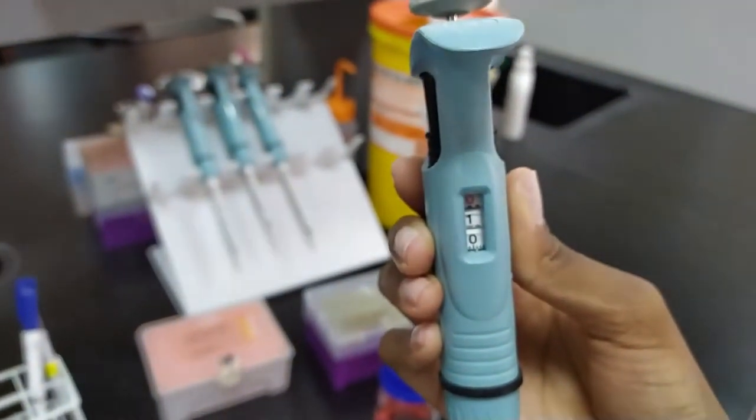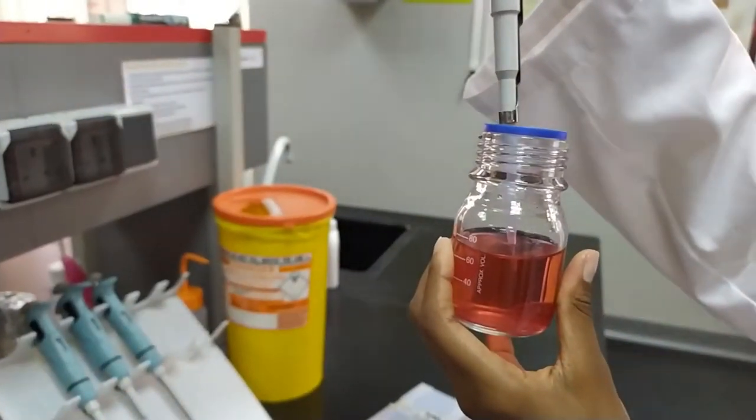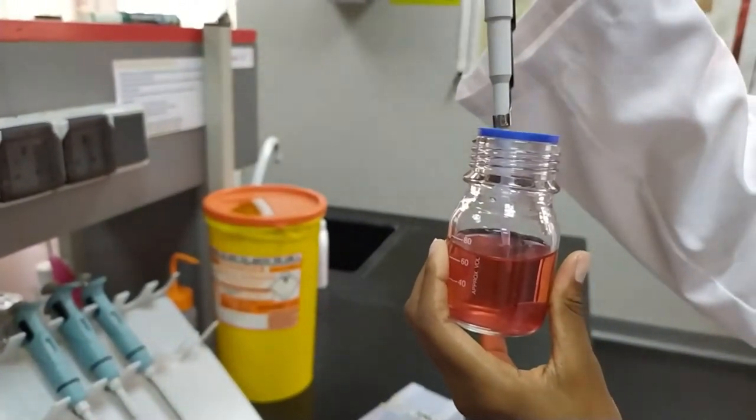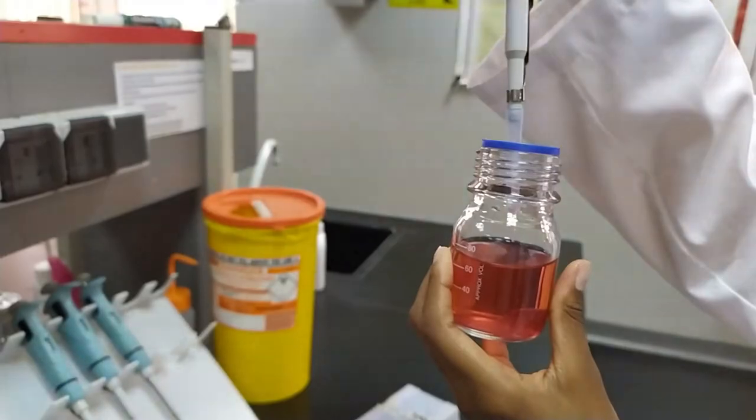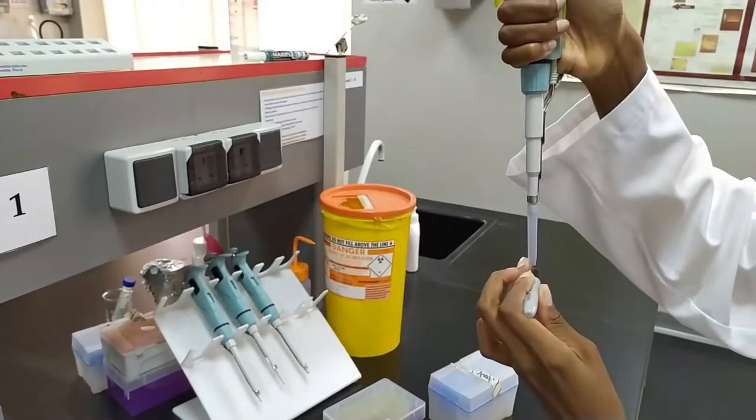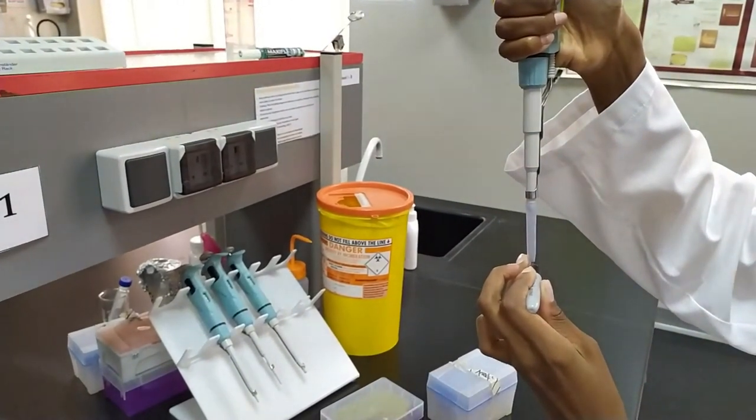She's then going to properly take up 100 microliters to show what that's supposed to look like. And she's going to mark it with a sharpie to indicate where the level should be.